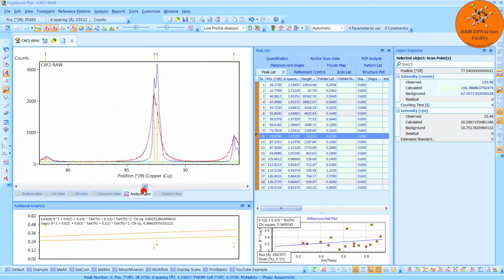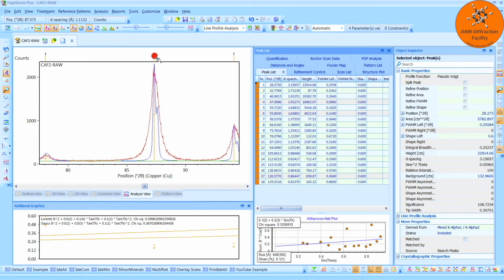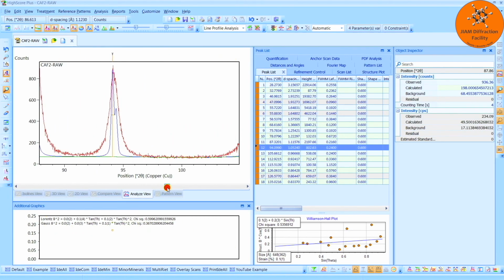Here we do have something weird. This has two K-alpha-1 peaks, but it should only be one. So I can put my cursor over this right-hand peak marker, and while peak list is open, I can just hit delete on the keyboard. That looks better, so I will continue to scroll to the right.